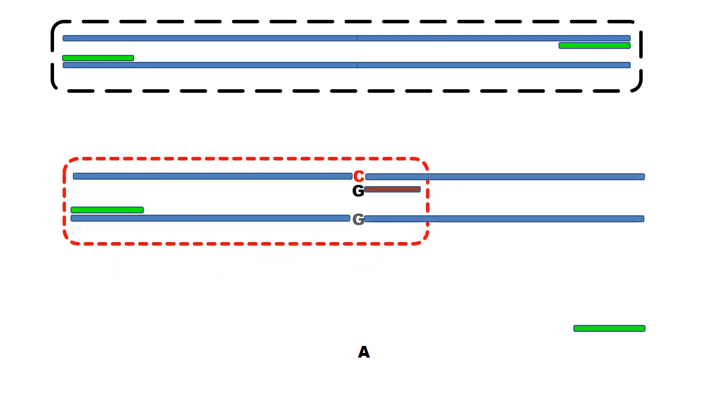The second part shows an outer primer attached to the reverse chain and an inner reverse primer attached to the forward chain, and the dotted red line shows the DNA region that will be amplified, meaning the length of this product.